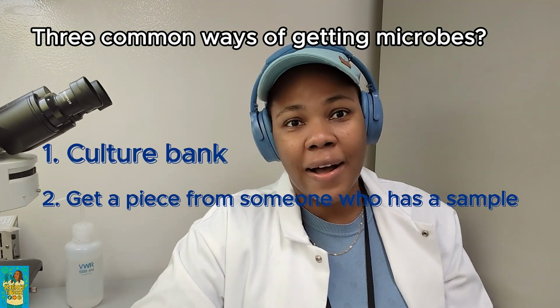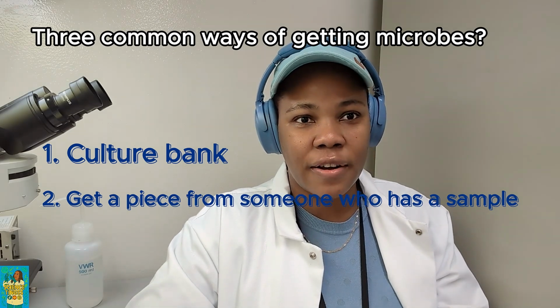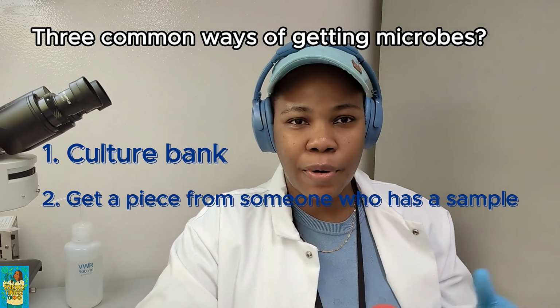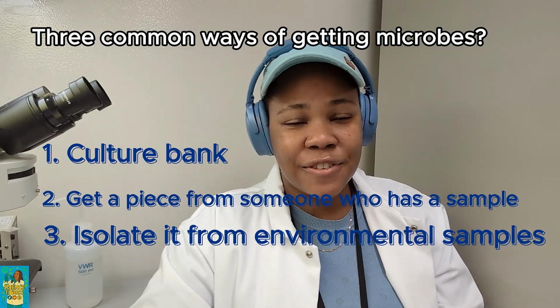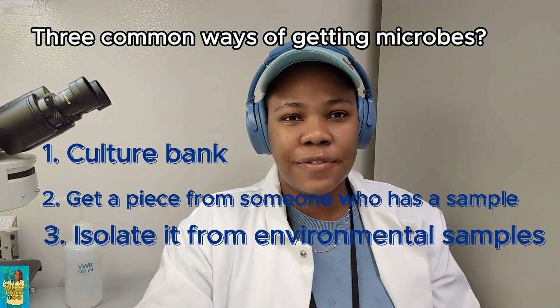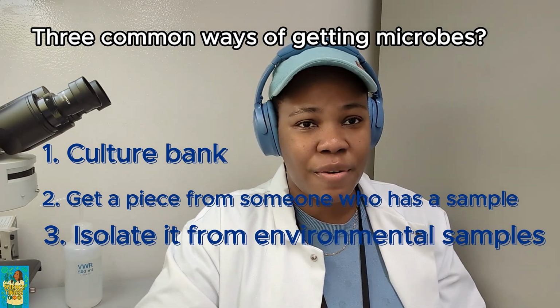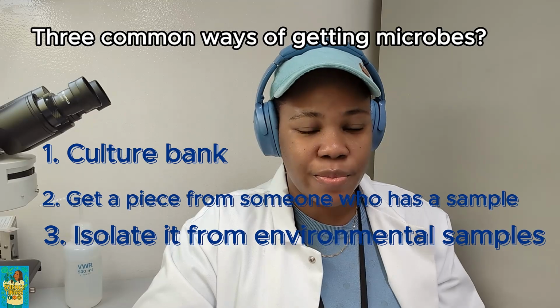Or if you have a friend, a prof, whatever, who works at a university and they're using your particular microbe of interest in their lab, you can ask them to share a sample with you, just a little piece, and then you can propagate that, grow that up. Or you can actually isolate it yourself from environmental samples. So it could be from diseased plants, if you're looking for a pathogen, from the roots, stems, or the soil, or water, whatever environmental sample. Or from a commercial product, you could buy that and isolate it from the product.